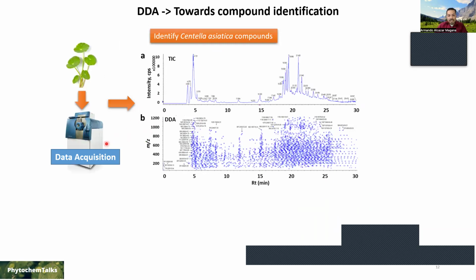So this is a typical chromatogram. We have the retention time. This is at 30 minutes. Now we are trying to make methods of about 15 minutes. We have the intensity, and these are the first two dimensions that are more evident. But we also have the dimension of the mass-to-charge ratio, right?